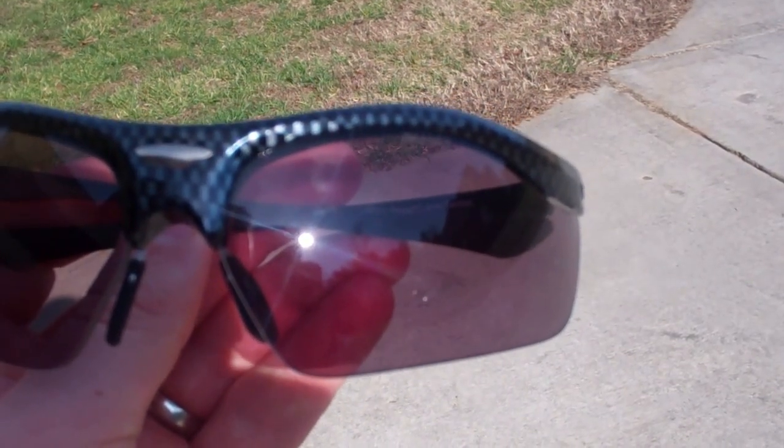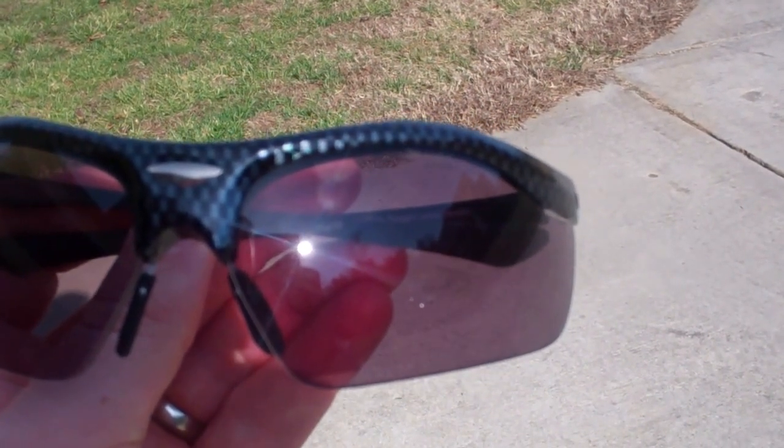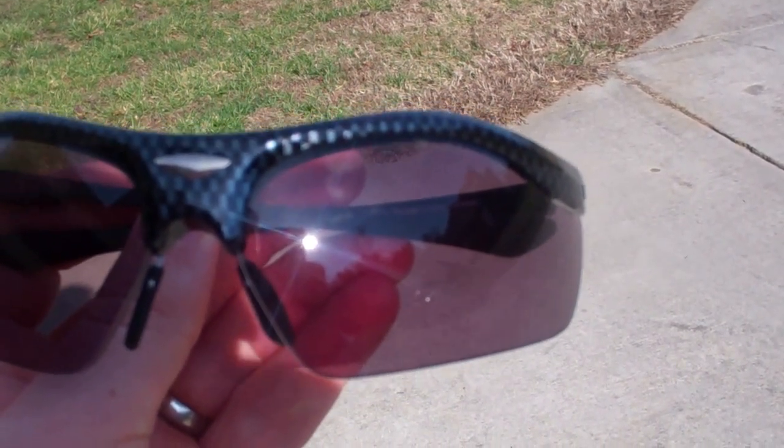If you have these, don't keep them out in the sun and don't leave them on your dashboard. Keep them in the nice case that they come in, so that you don't end up with permanently dark safety glasses.